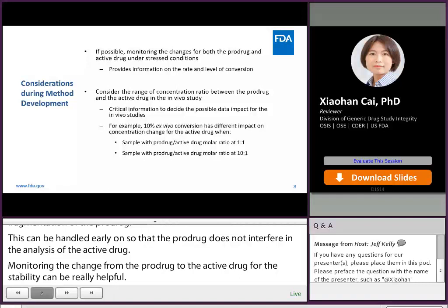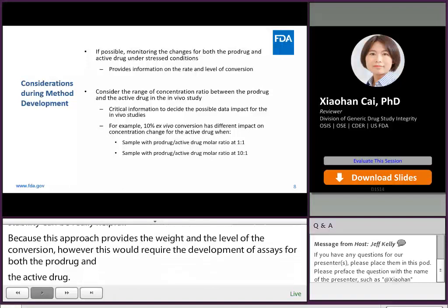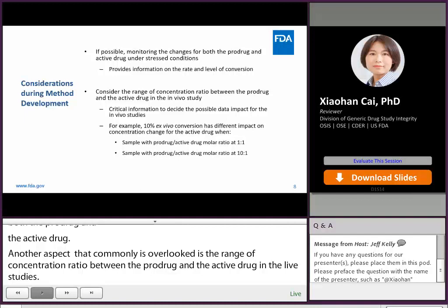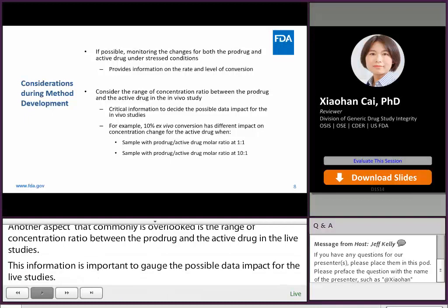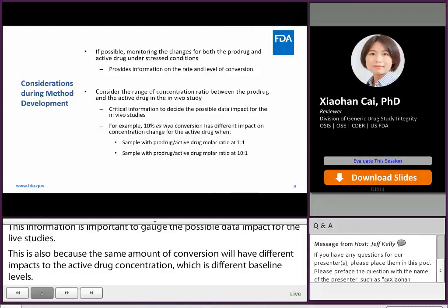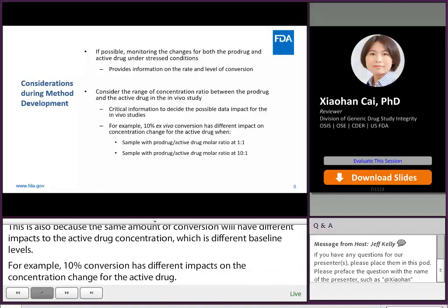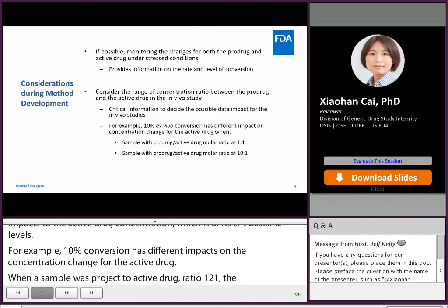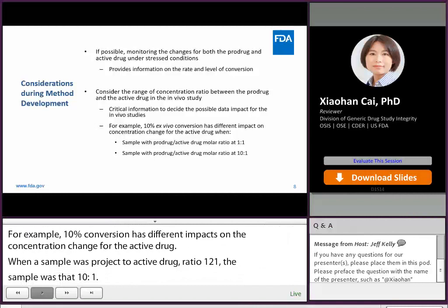Another aspect that is commonly overlooked is the range of concentration ratio between the pro-drug and the active drug in the in vivo study samples. This information is important to gauge the possible data impact for the in vivo studies, because the same amount of conversion would have a different impact on the active drug concentration depending on the baseline level. For example, 10% ex vivo conversion has a different impact when the pro-drug to active drug molar ratio is 1-to-1 versus 10-to-1. Generally speaking, the higher the ratio between pro-drug to active drug, the larger the impact on the active drug data.